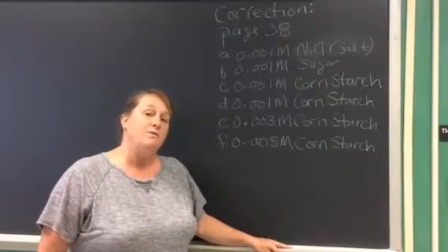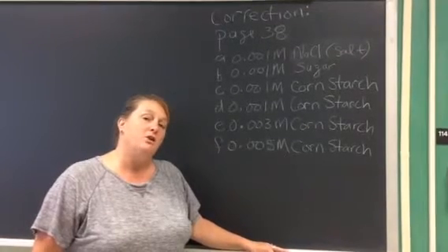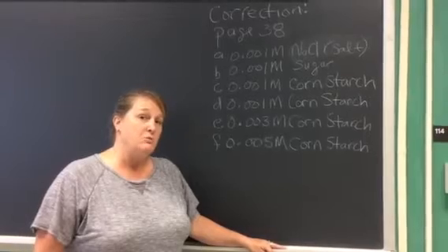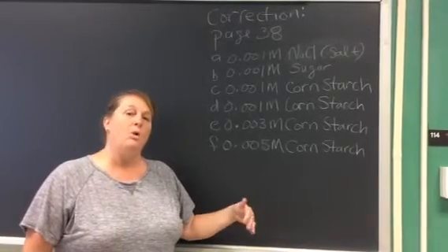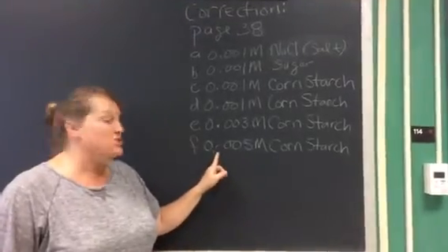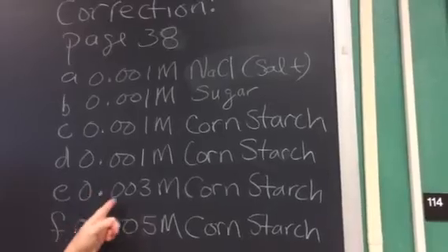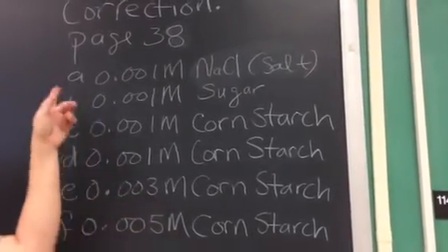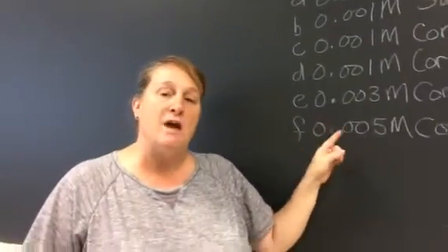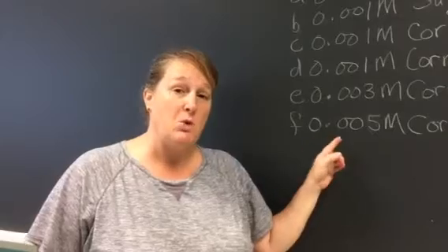Hopefully you have read that, gone to the take action part, and looked at the protocol. There's a correction on page 38 in your protocol. It says 0.1, 0.1, 0.3, 0.5 molar, and we need to change that to 0.005 molar, 0.003 molar, etc. So this will be written on the board. Make sure that you note that change, and when you mix those solutions that you mix them appropriately.